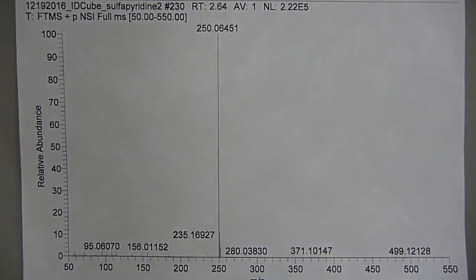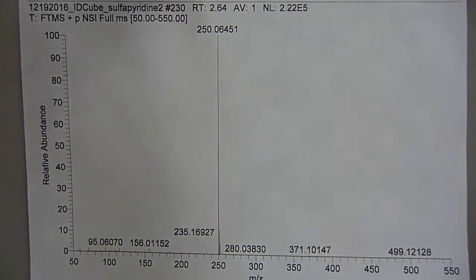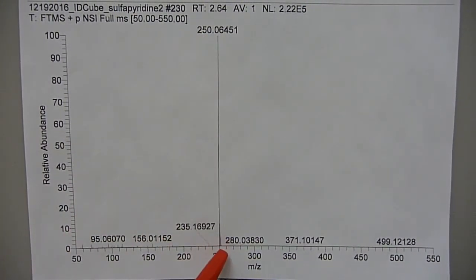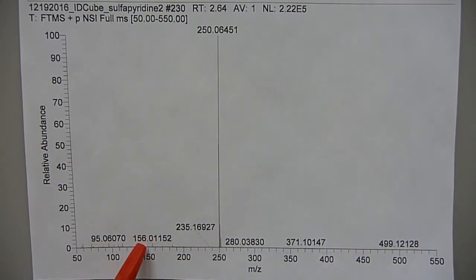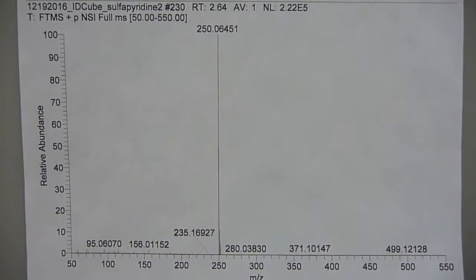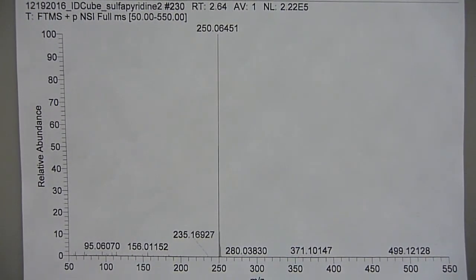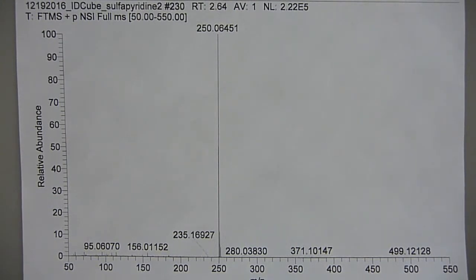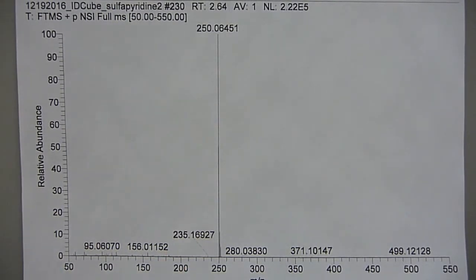Looking at the positive DART spectrum, you can see a nice M+1, with a tiny bit of the 156 and maybe just a tiny inkling of the 184. The DART source is a much lower energy one - you're exciting helium at around less than 500 volts, generating metastables. The metastables then impact the sulfapyridine, which does the ionization. So it's a much gentler ionization.